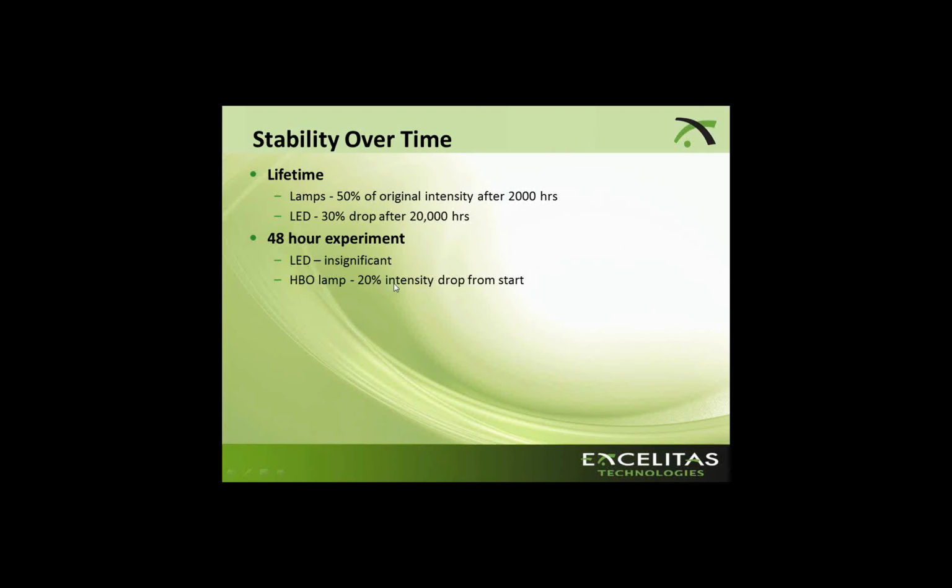So that's just a brief summary of LEDs, lamps, the different technologies, and why you would use one versus the other, the pulsing, and how it helps increase the lifetime of your sample and of your fluorophores. Again, I do encourage you to check out the webinar on our website about lamps versus LEDs and phototoxicity indicator.